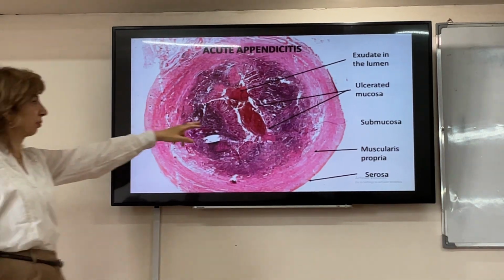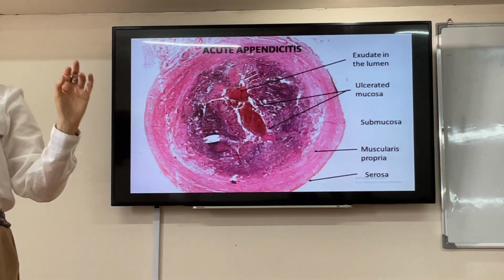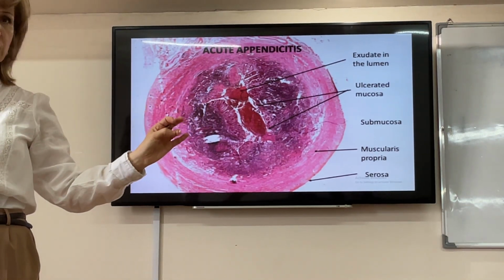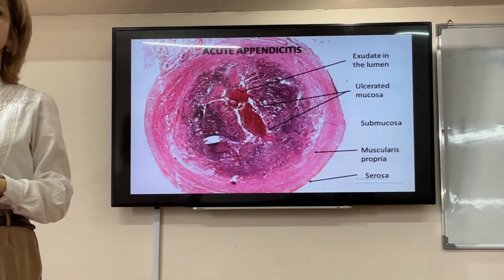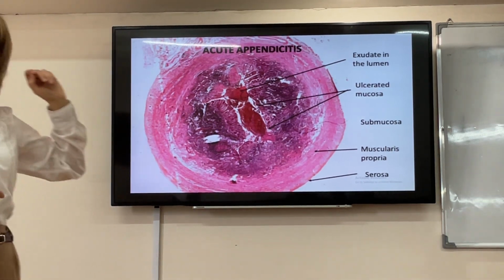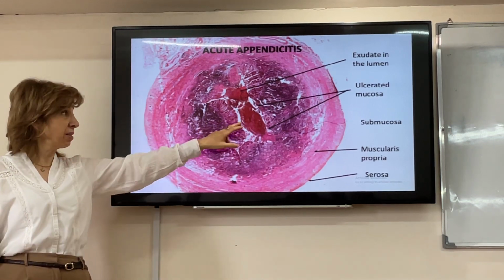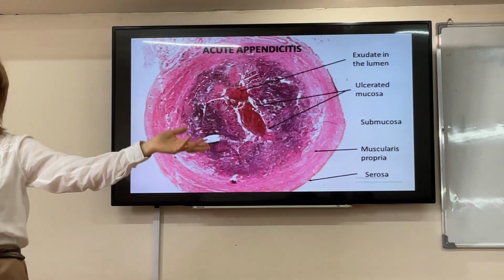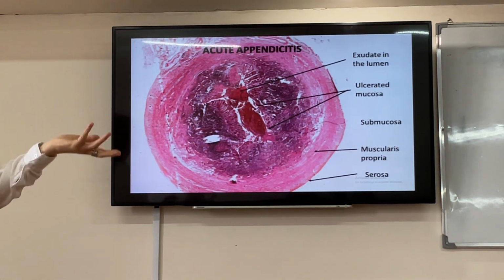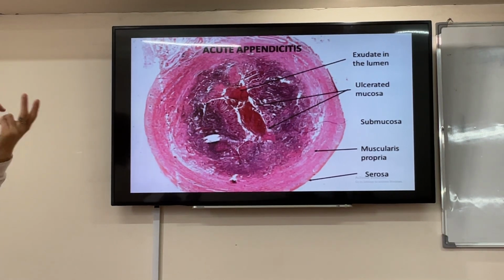Start. This is purulent inflammation. Yes? Acute appendicitis, purulent inflammation. Now, you will tell me, this is acute appendicitis, it is purulent inflammation. What do I see in purulent inflammation? Pus. Yes, what's the hallmark? Pus, abscess. What is abscess, pus? Tell me. Accumulation of neutrophils with bacteria, with cellular debris, with edema, everything.